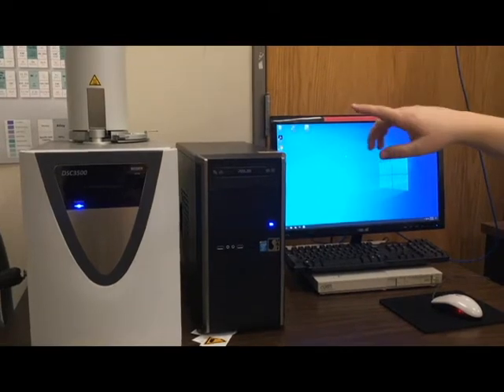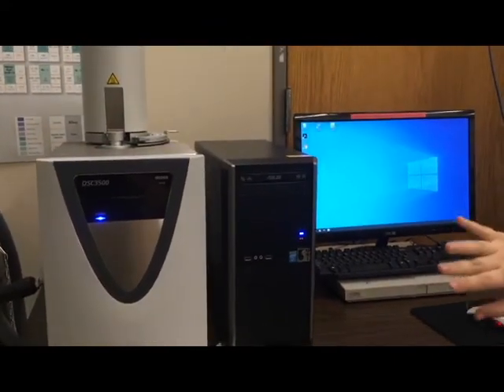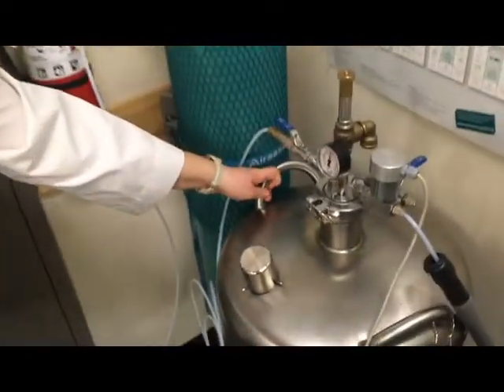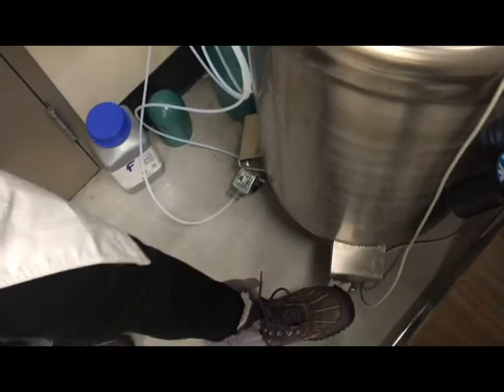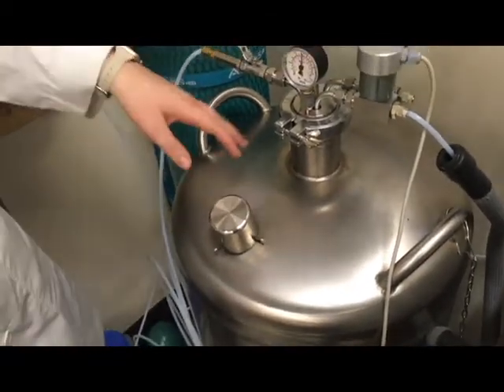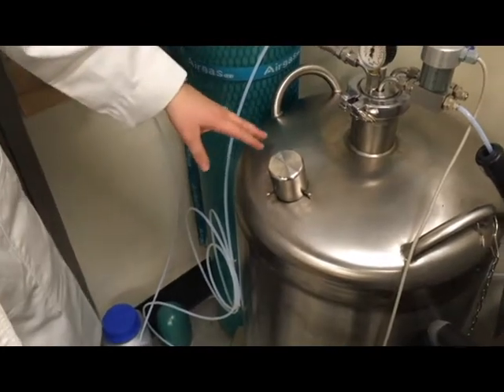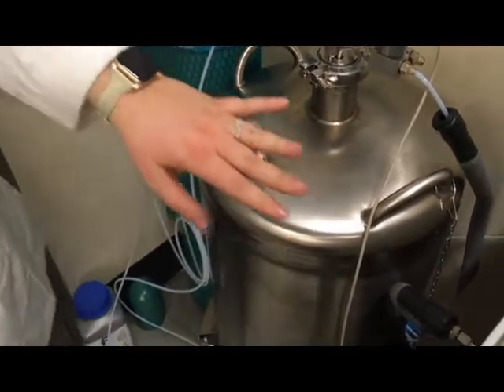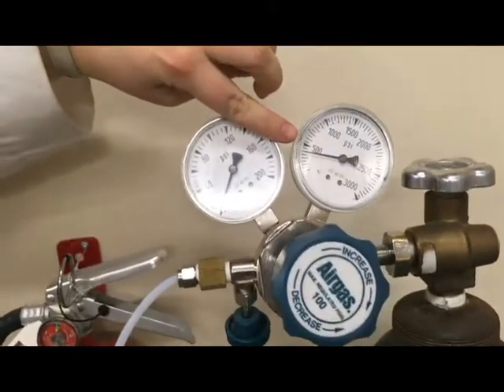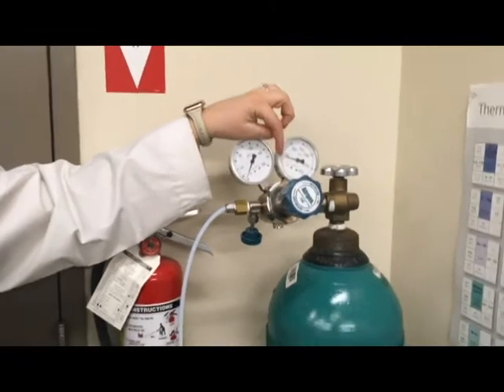The machine will typically be in a closed position as far as the auto sampler is concerned. Make sure there's liquid nitrogen in the container — the best way to check is to release the two brakes at the bottom, shake it, and release. If it's full there would be a little bit of sloshing. If it's empty, as a client you would just request that lab staff fill it for you. Also check that you have enough gas and that it's turned on. We have a little under 500 psi, which means the tank is pretty close to empty, so I'll order a new one. If you notice it's below 500 psi, just let staff know.